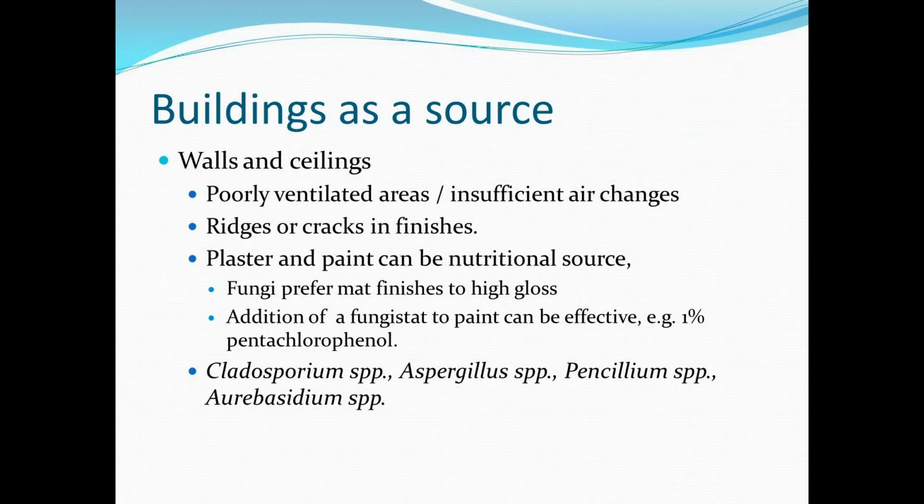Okay, so looking at buildings in a little bit more detail. With walls and ceilings, poorly ventilated areas where there's insufficient air changes will help fungal spores remain in the area. And that's something to take note of. At the moment there's quite a drive in the pharmaceutical industry to reduce the air change rates in clean rooms in order to save energy. But you need to be sure that you're not going down so far as to lead to poor air distribution patterns.